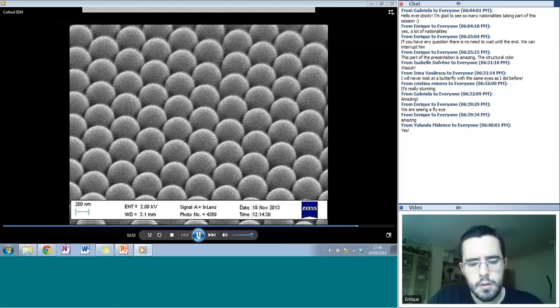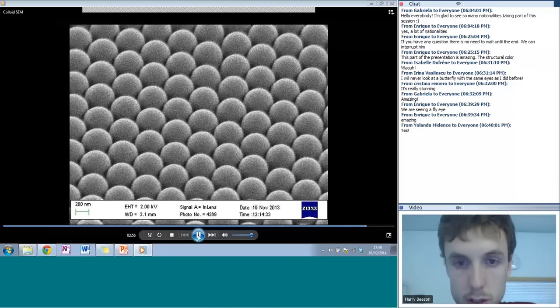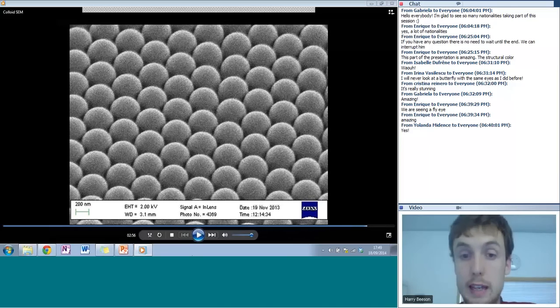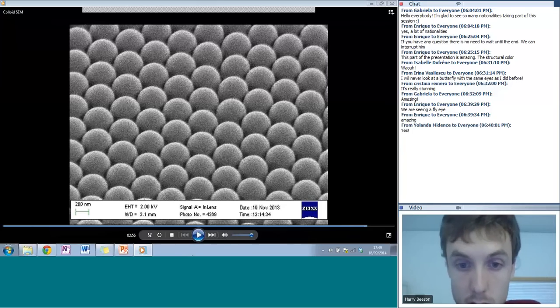And you can see now we're able to really zoom in and see very nicely those spheres. Actually, I should say that the resolution there is limited by our screen grabbing software, so the actual image that we would see on the microscope is even clearer than that. And these are spheres that I think were 500 nanometers in diameter, although you could image easily beneath that.